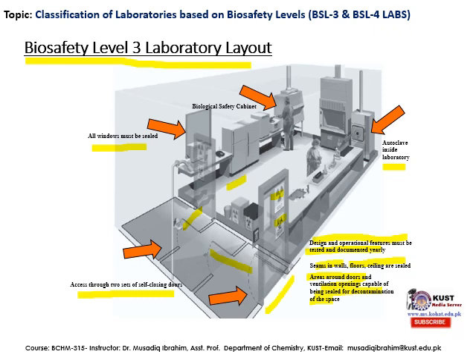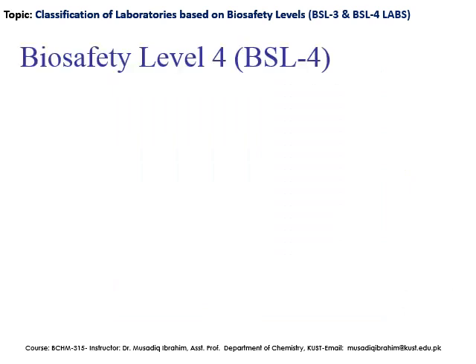There is also a biological safety cabinet which is present here, and the bio-waste container is also present here, where the decontaminated bio-waste is gathered. And the centrifuges have aerosol-proof rotors so that aerosolization of the contaminants in the lab should not take place. Now moving towards the biosafety level 4, BSL-4 labs.